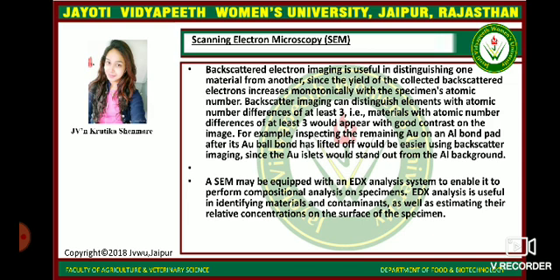A SEM may be equipped with an EDX analysis system to enable it to perform compositional analysis on specimens. EDX analysis is useful in identifying materials and contaminants as well as estimating the relative concentrations on the surface of the specimen.